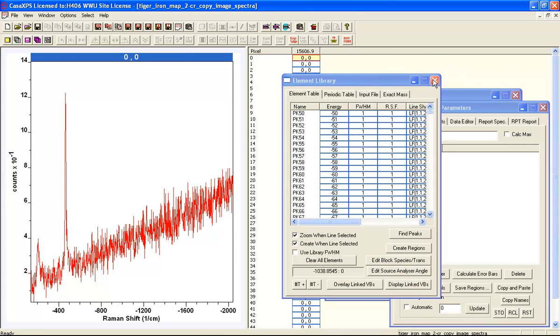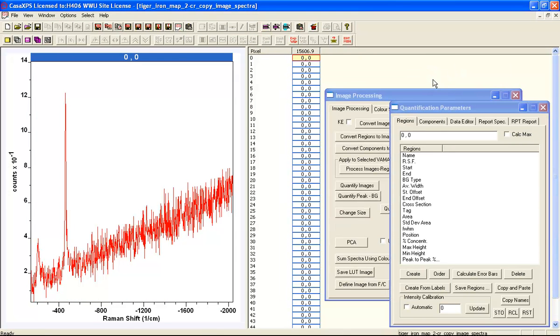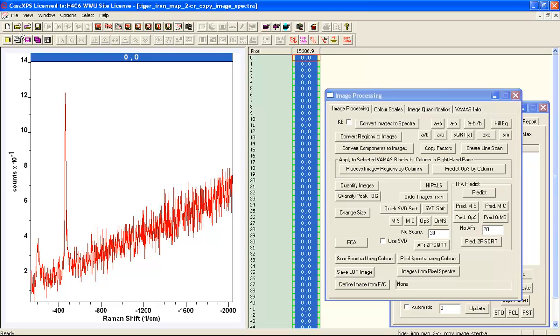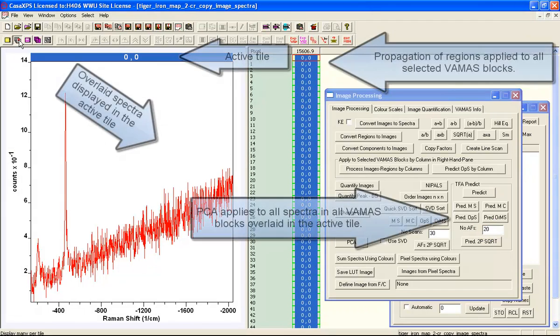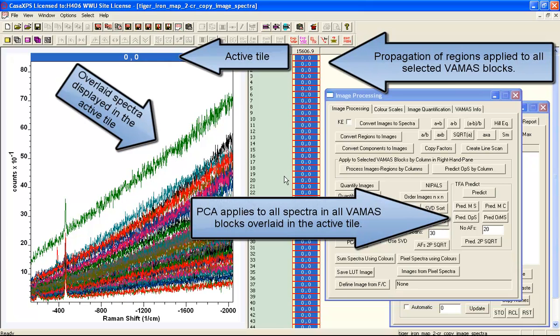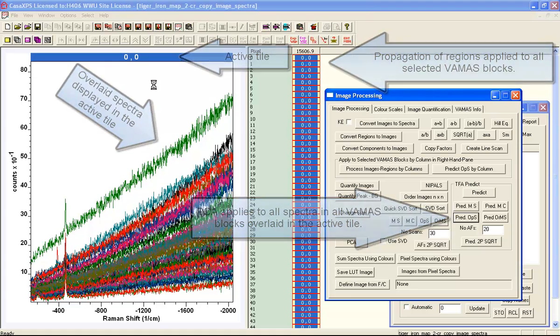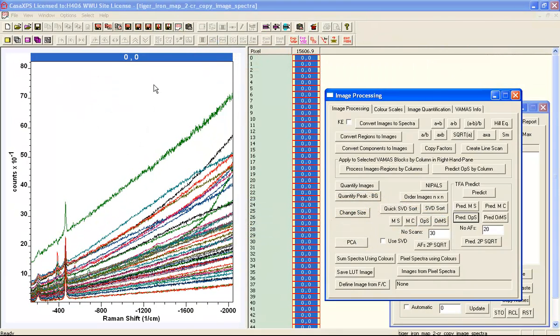We'll first of all do a little bit of signal enhancement here. These spectra are noisy because the acquisition time has been split across many pixels.